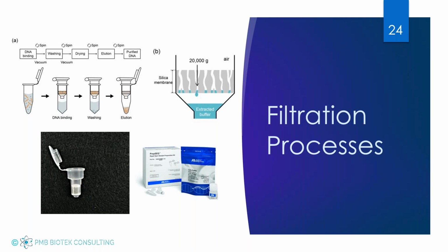So whether you're using a silica-based column where you're only allowing the target bacteria to get through because you can spin it and separate it, and so only very small organisms will actually get through, and the particulate is bound up in that silica. And so there's a whole host of different methods that you can use. And these prep steps and these extraction protocols are universal. So it's something that you can explore in your lab to really optimize a technology you're already using to reduce those false positive results or those invalid results you may be seeing.